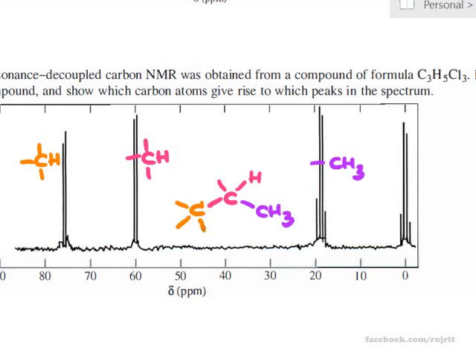And because the yellow and pink contain only one hydrogen atom, and the molecule contains 3 chlorine atoms, that means chlorine atoms have to be here, here, and here. And that's it. So as you can see, the carbon in yellow color contains 2 chlorine atoms. These 2 chlorine atoms are very high in EN value, and pull the electron clouds towards themselves. And then your carbon here is deshielded, right?